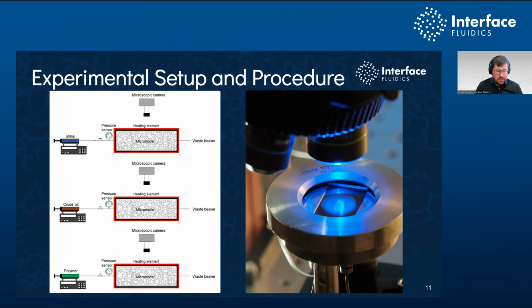We then displace that brine with crude oil of interest. We displace that to the point where we have a representative initial saturation of that oil-water ratio. And then we're going to run either further water, polymer, or combined water-polymer floods to understand how displacement works, recovery factors, and any sort of pore scale interactions that we can capture.